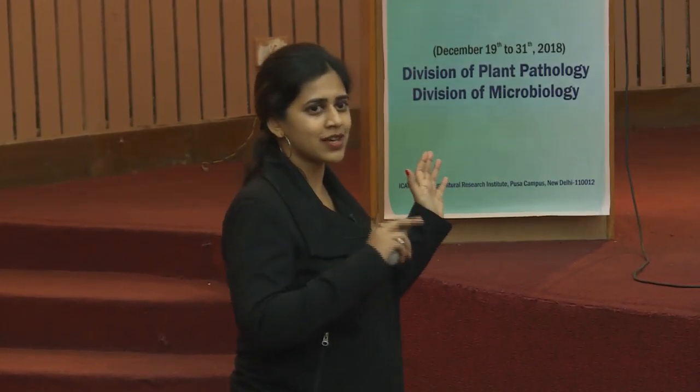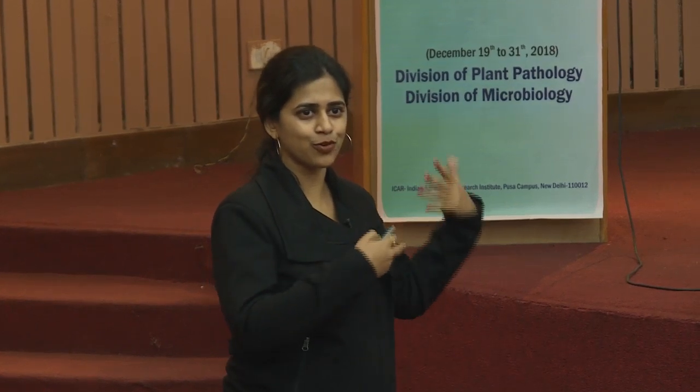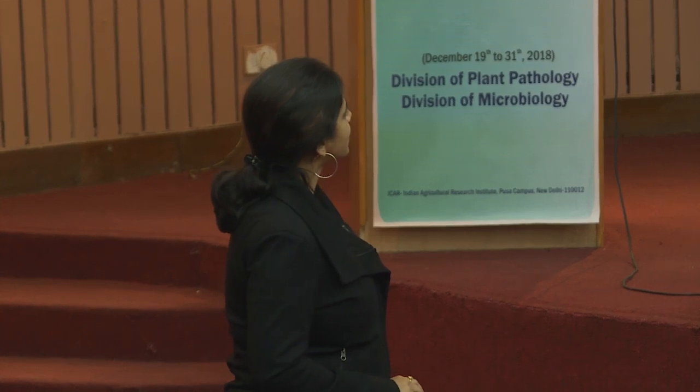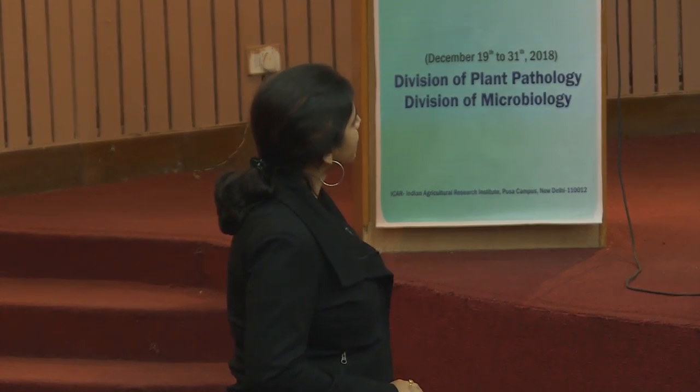So, behind the software this is what works, but when we are using it, we do not actually go to this depth, we are just explaining how it has been done. For example, we use overlapping, which is just sequence matching being compared.